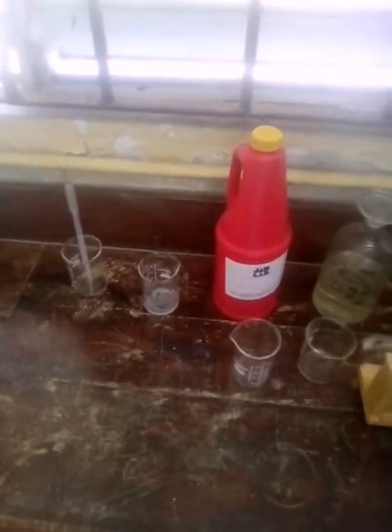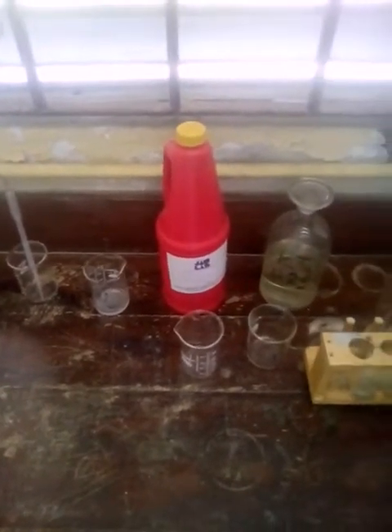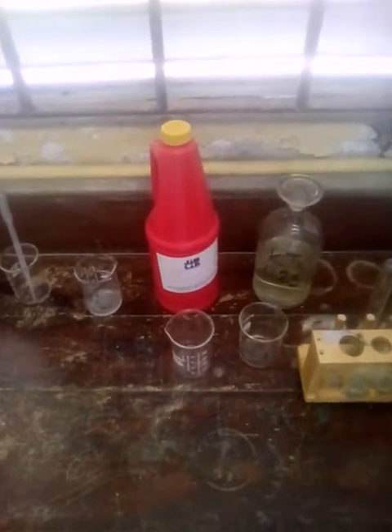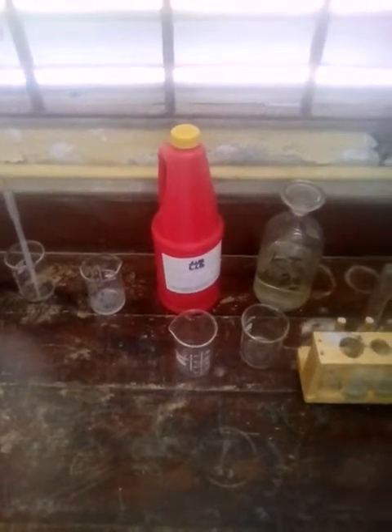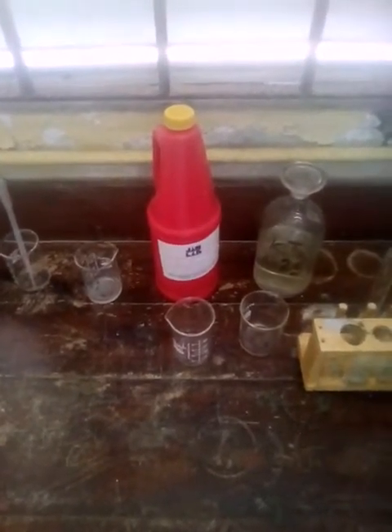So we'll be using dilute sulfuric acid to create that acidic environment for the reaction to be as effective as possible. That is basically what we'll be doing for this experiment.